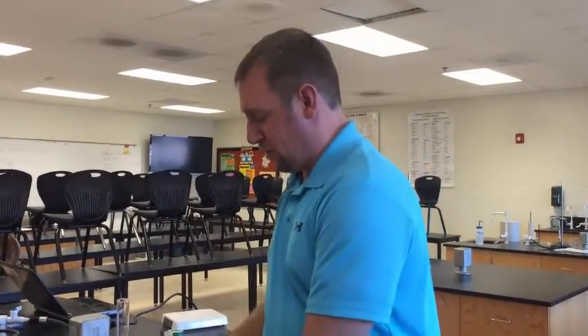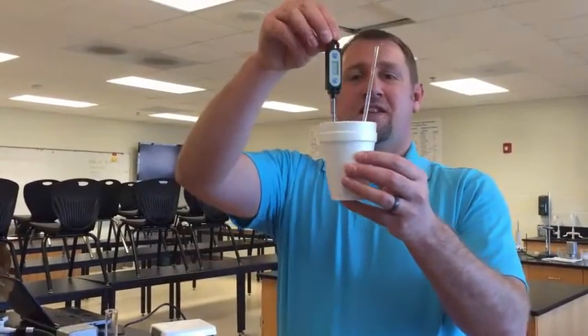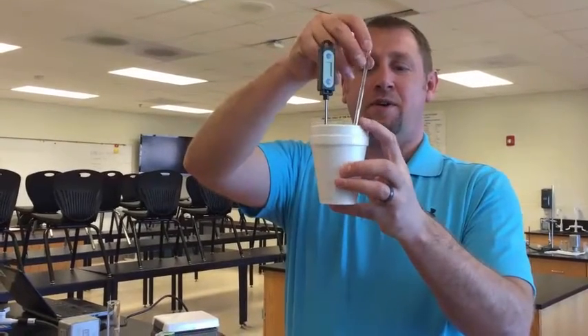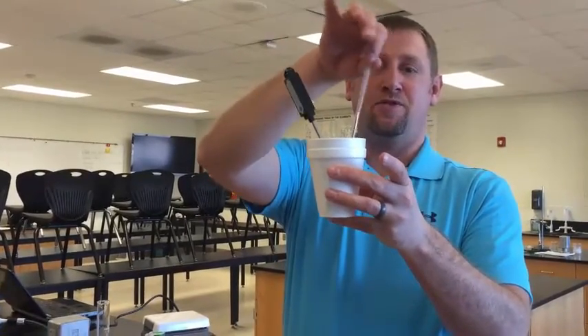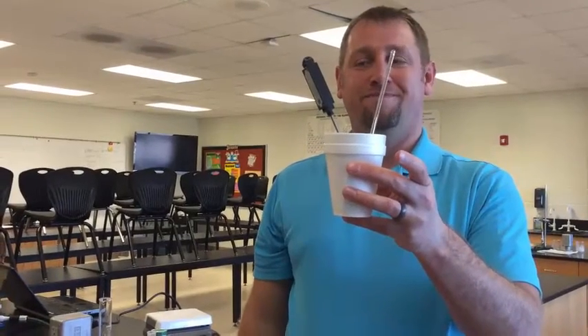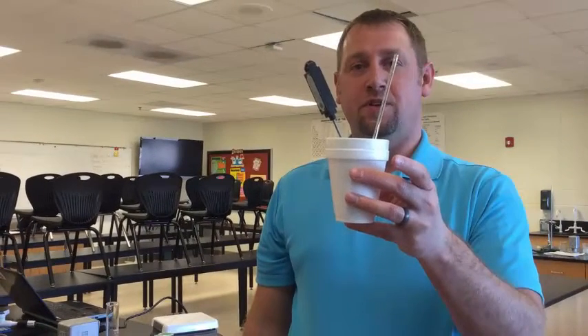A very important tip: you need to get the initial temperature before you add the solid to this calorimeter. Once the solid is added, you will stir and monitor the temperature. That is the basic procedure for using a calorimeter and measuring the heat of solution when you add a solid.